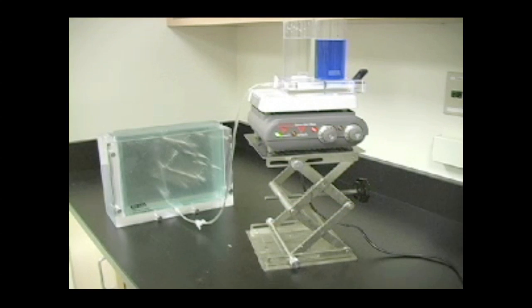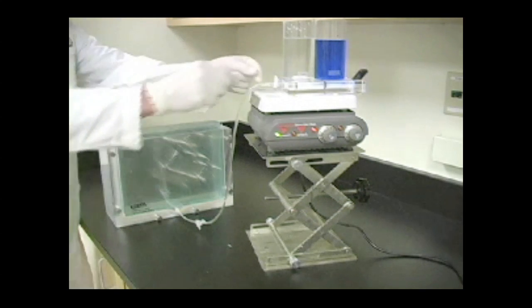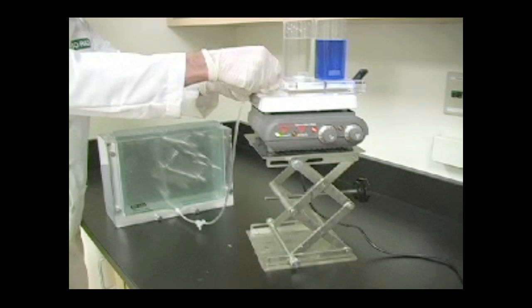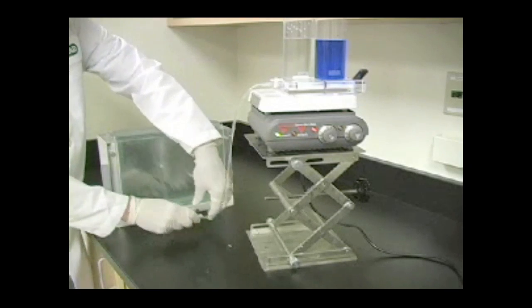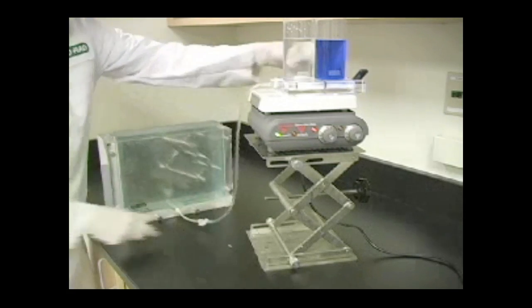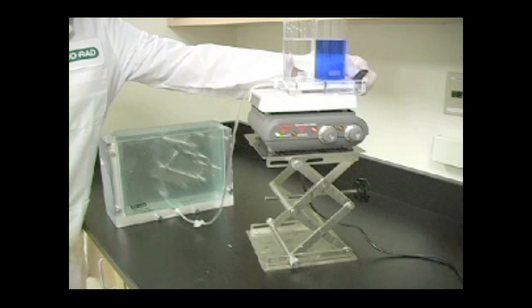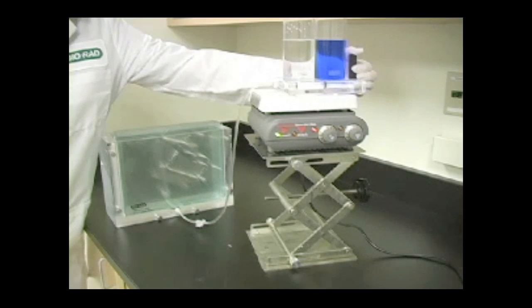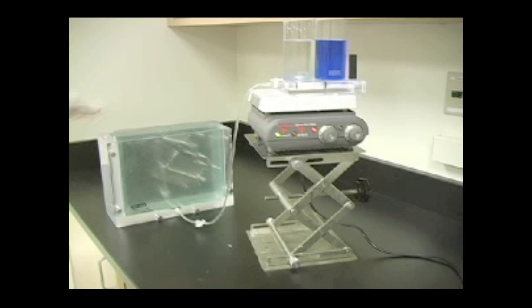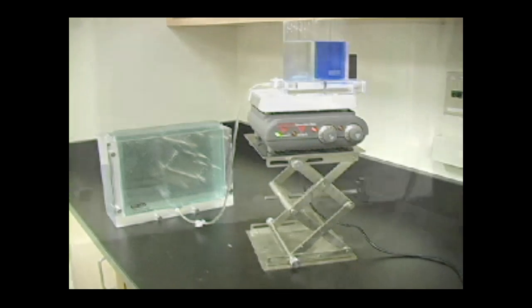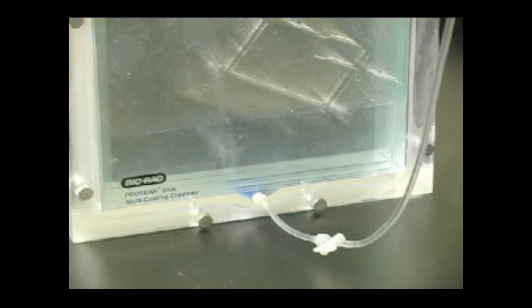Start casting the gels by opening the stopcocks to the casting chamber and the gradient former. Allow the light monomer solution to enter the casting chamber until the level of the light solution is equal to the level of the heavy solution. Open the valve stem on the gradient former once the solution levels are equal. Do not allow air bubbles to enter the gel. This should help compensate for the v-groove in the multicasting chamber.